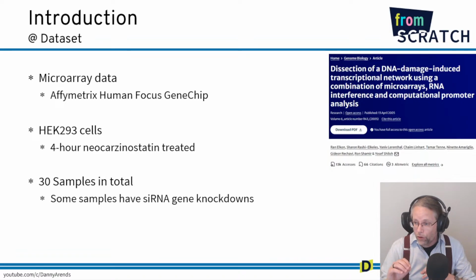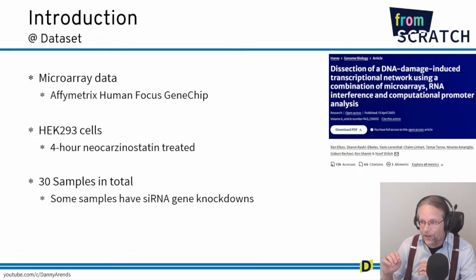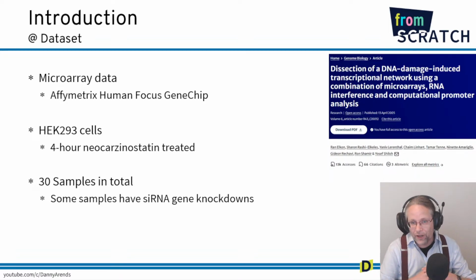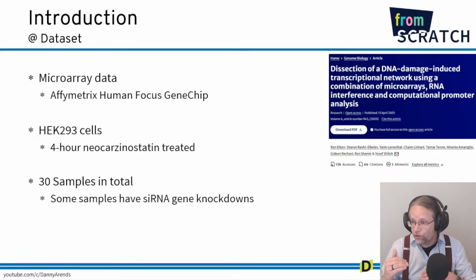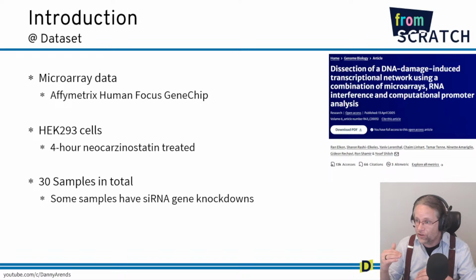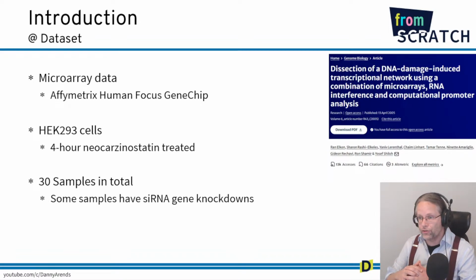So the paper also has a gene ontology analysis. So after you're done, you can benchmark your code and compare it to what they did in the paper. I always think that's really fun, that this paper, which was published in 2005, so it's like 19 years ago, that you can still redo this. So that's awesome. I love it.